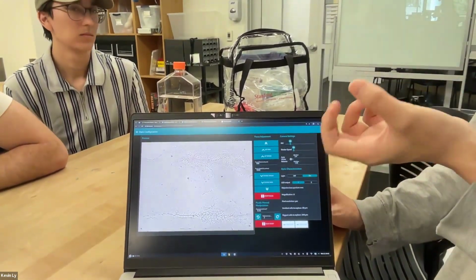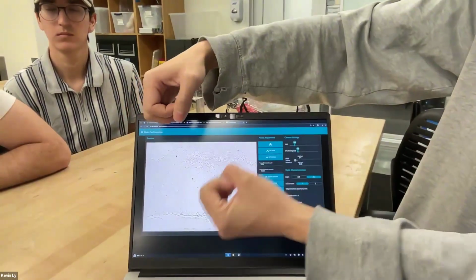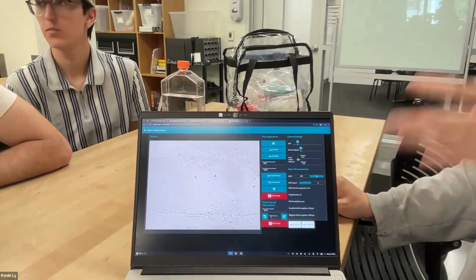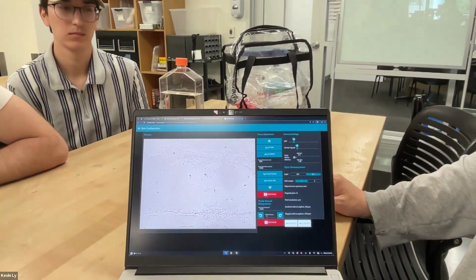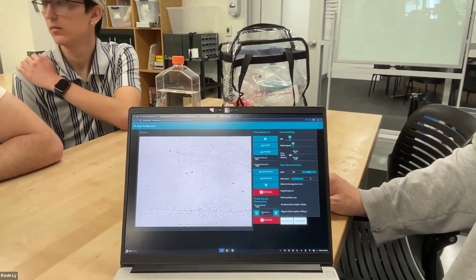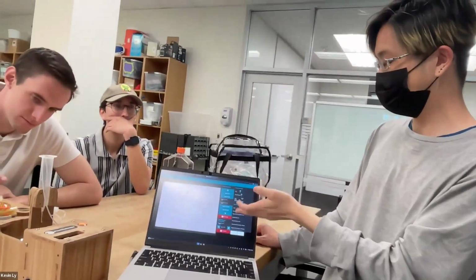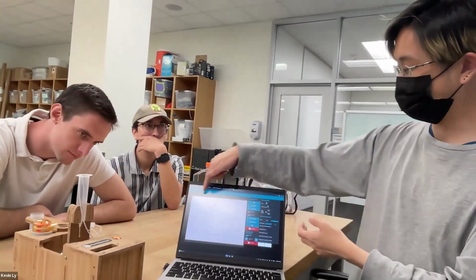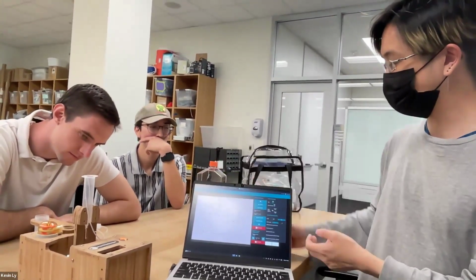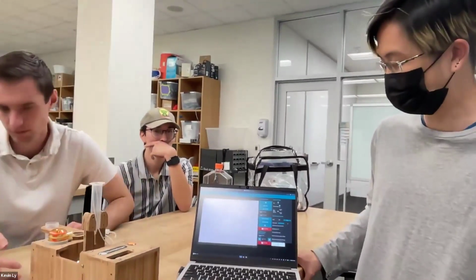And those are the masks that are used to say, this is object 1, this is object 2, this is object 3, and so on. So it's not sophisticated at all. It was also written before I joined the project, and I think they want to rewrite the thing, but I'm not involved in that. But what we have is, when the data gets collected, it saves a series of these raw frames. And then you can do whatever you want with them if you don't like the existing segmentation algorithm.